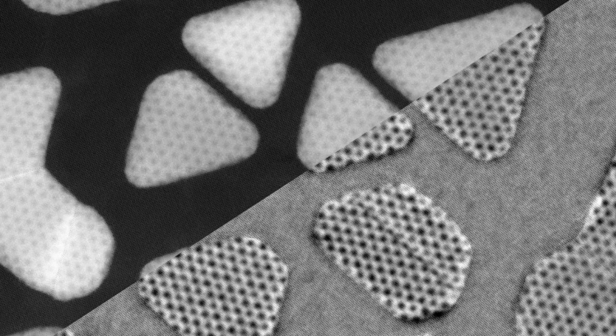The researchers used a combination of techniques called 4D STEM and integrated differential phase contrast to achieve that process of extracting the full structure at the interface from the image. The researchers showed through modeling that electronic properties are expected to be modified in a way that can only be understood if the full structure of the interface is included in the physical theory.